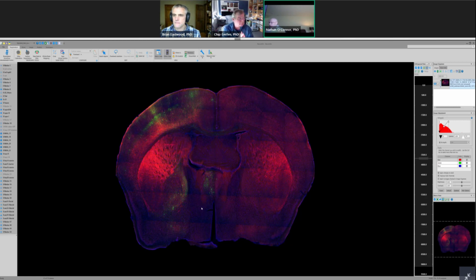One straightforward one I can answer: is this ready to be used as of today and can it be downloaded? It is ready, with the caveat that we have released the pyramidal cell classifiers, but not yet the c-fos. That's coming soon, I hope. As Brian said, it is still an active area of research, but I hope to release that sooner rather than later.